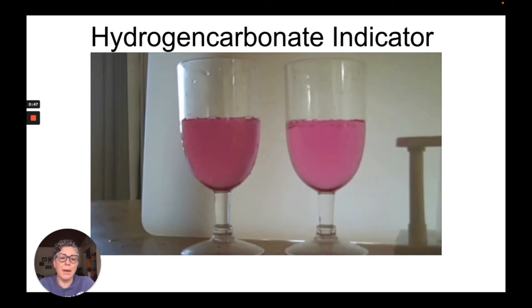In this particular experiment, someone is just going to blow into one of the glasses and you can see the presence of carbon dioxide turns the indicator yellow. So that means there's a high level of carbon dioxide that has been released into that particular indicator.